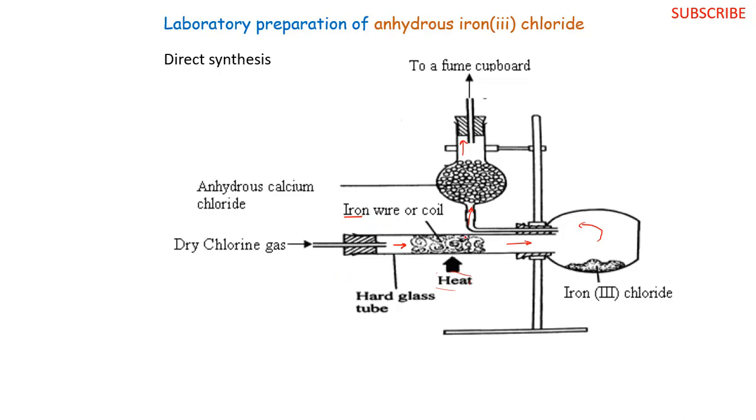After that, we shall heat our iron wire until red hot. We need to strongly heat the iron wire until it becomes red hot, that is to say until it starts glowing. At that point, we shall pass our dry chlorine over our red hot iron. At this point, even if we stop heating, the reaction is kind of self-sustaining.